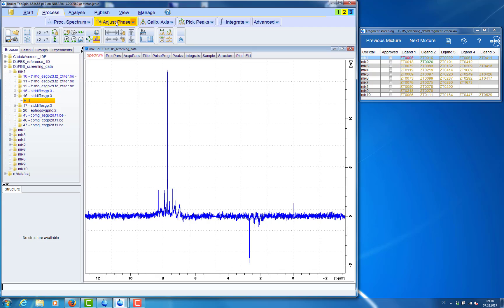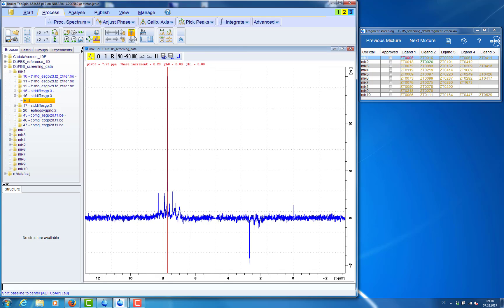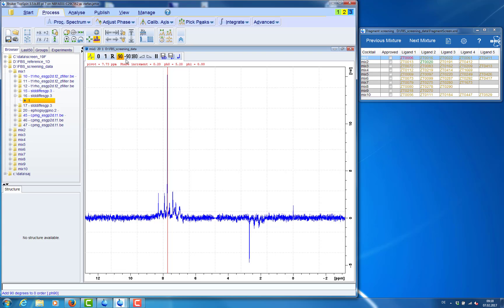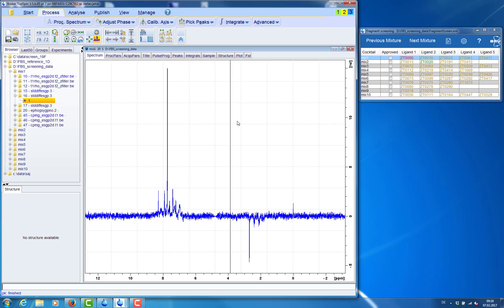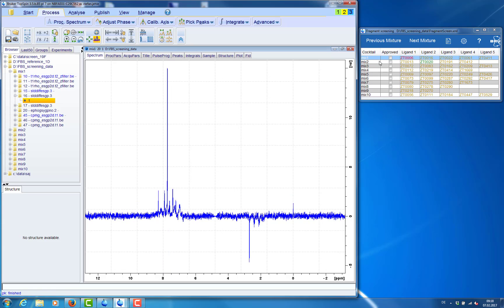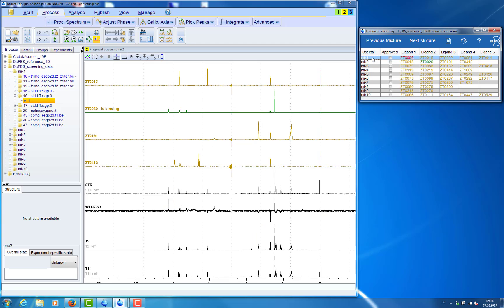And then we can for example adjust the phase. And save what we have changed in this spectrum. And when we go back to our mixture the reprocessed spectrum will be automatically updated.